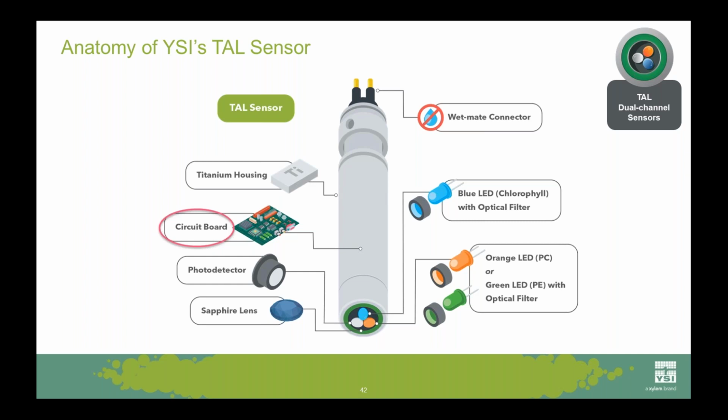I learned working with that R&D team at YSI that the circuitry in the PCB is sort of like a car engine in idle. It's always humming in the background, and it's causing a baseline frequency that we call noise. If the board is not well designed, that car engine is idling higher and the noise is higher. That makes it harder for the sensor to know what the real signal is that's coming through the board via the photodiode.